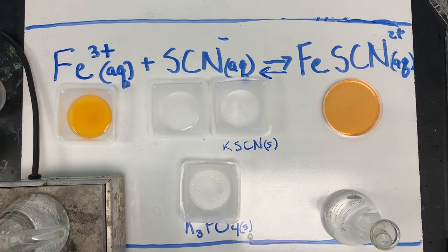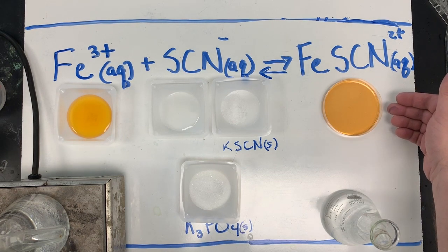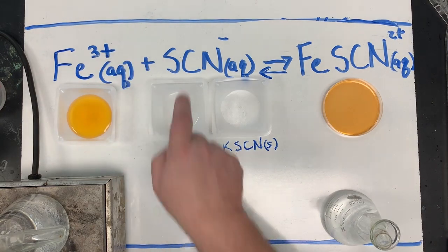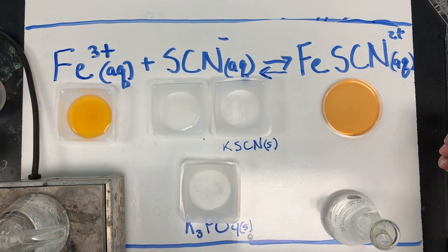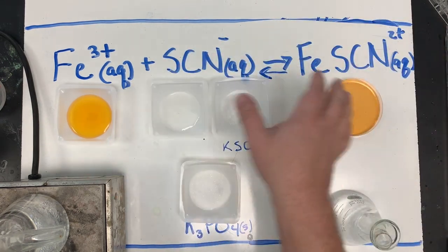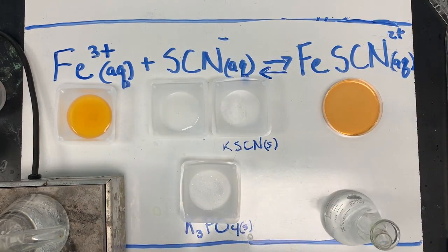Now that the solution is formed, let's play with the equilibrium. So in this dish, we have iron three plus, we have thiocyanate, and we have the complex ion that they form. They're in equilibrium moving back and forth. So we have all three substances there.